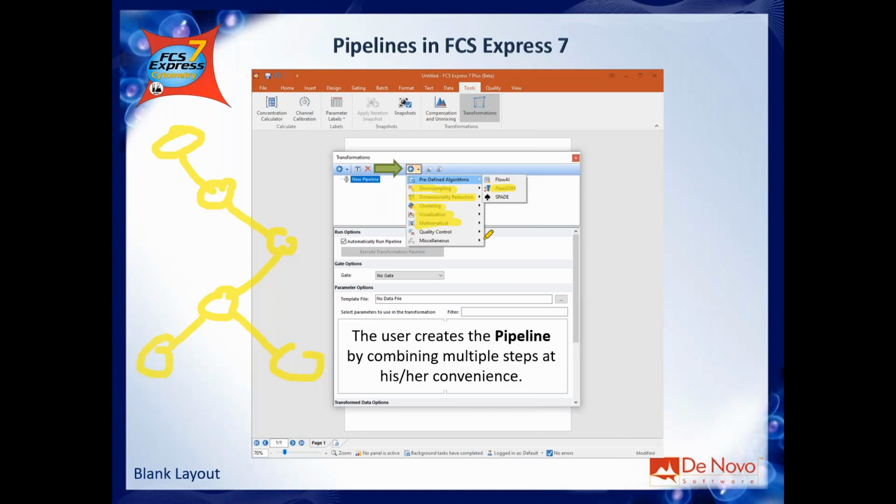We will spend quite a lot of time going more in depth into the mathematical steps, because a few of those steps are really beneficial for most of the algorithms that you might want to use. For example, the scaling step. Then we have some quality control. These contain 3 different quality controls. They have been developed for flow data, but I'm super happy to show you that one of them can also be used somehow to analyze image data. And then we have miscellaneous. We will see an example at the end.